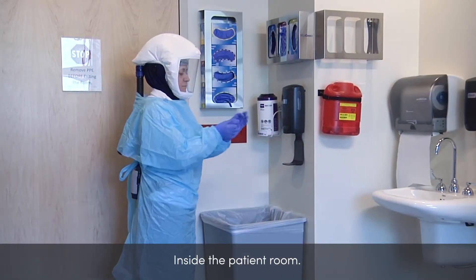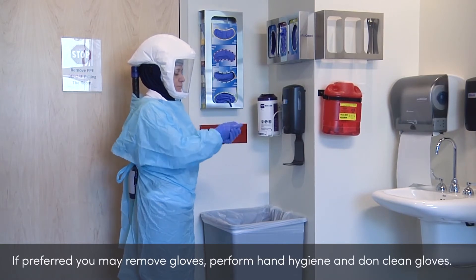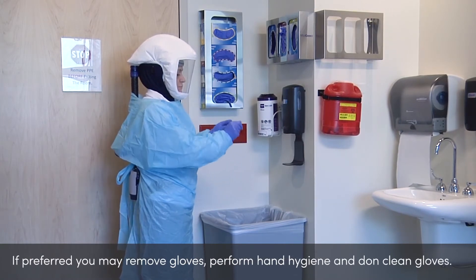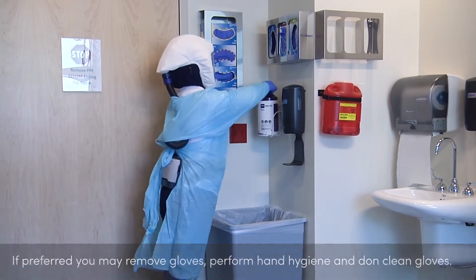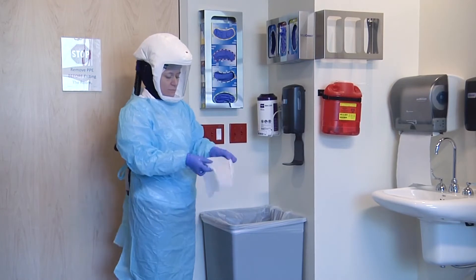Inside the room, sanitize gloved hands and allow time to dry. Or, remove gloves, sanitize your hands, and don clean gloves. Use SaniWipe to wipe off the PAPR face shield and hood.